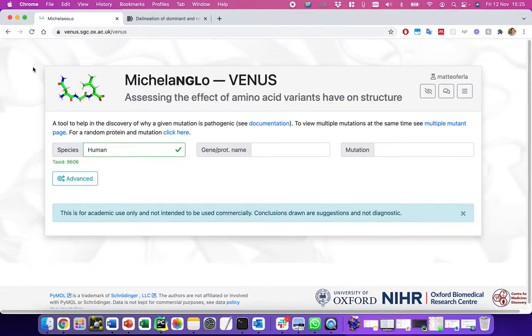I talk about MEF2C, a transcription factor that forms a dimer that's best represented via the Swiss model that was threaded against a homolog, because it's a dimer that binds to DNA, whereas the AlphaFold model, as we saw, was no good. Here I'd like to talk about a different protein, LZTR1, because this protein binds to HRAS, and the problem is that there is no crystal structure of LZTR1 bound to HRAS. As a result, we do need to get a bit creative.